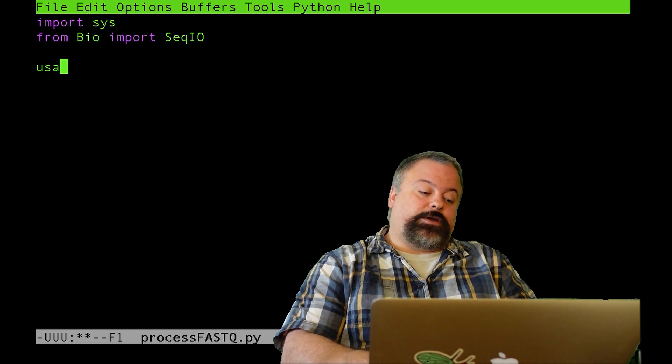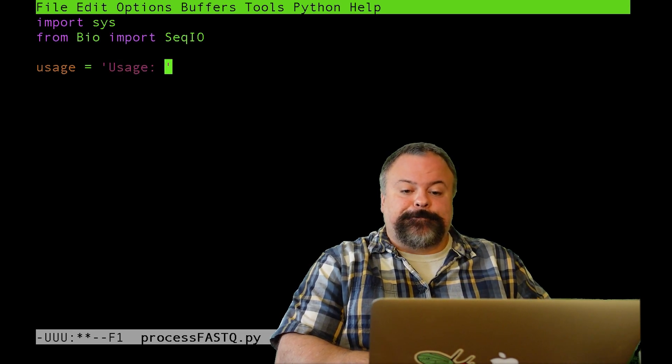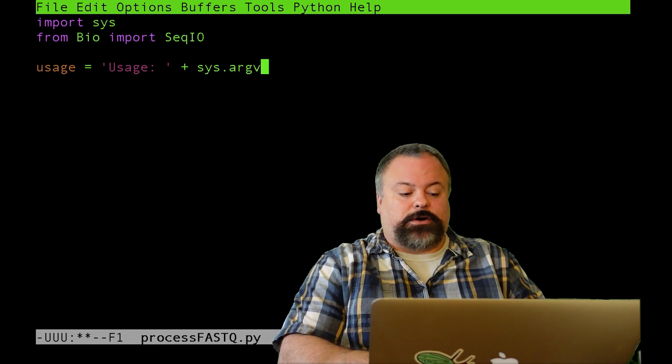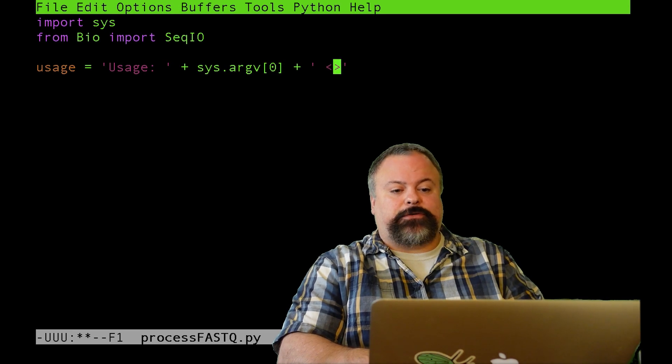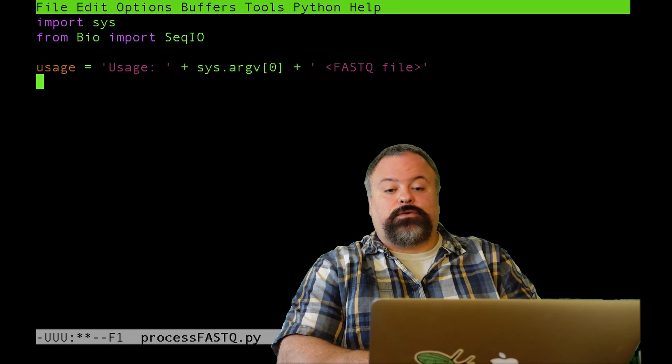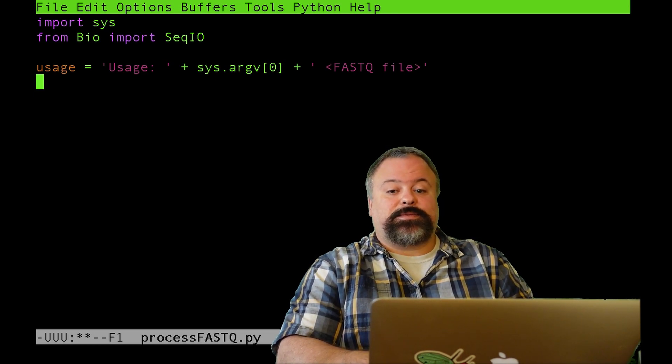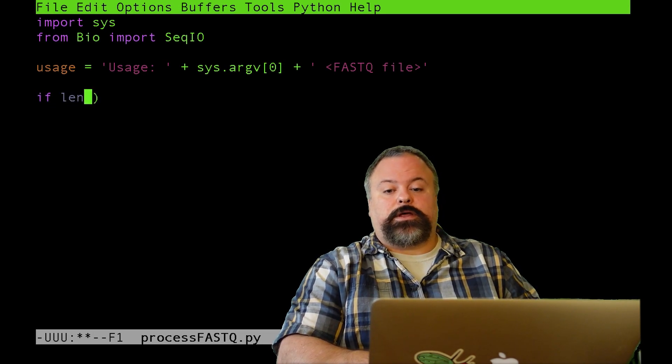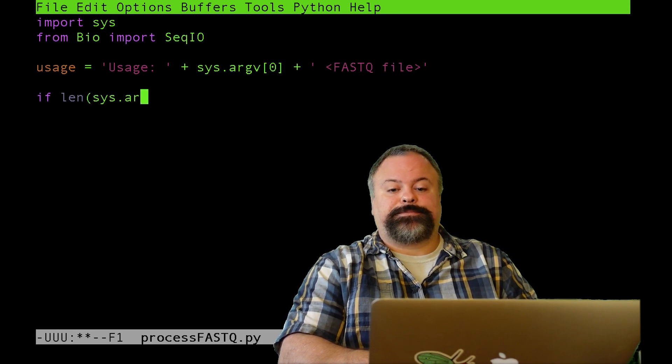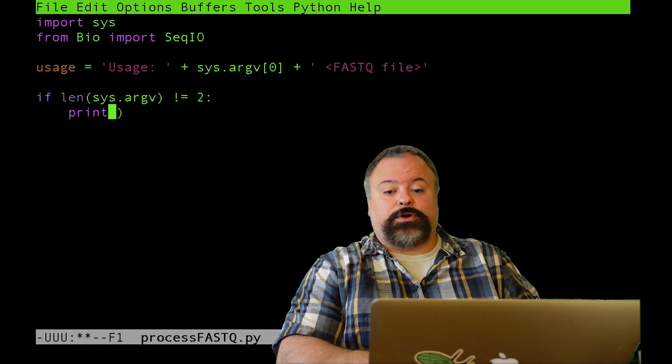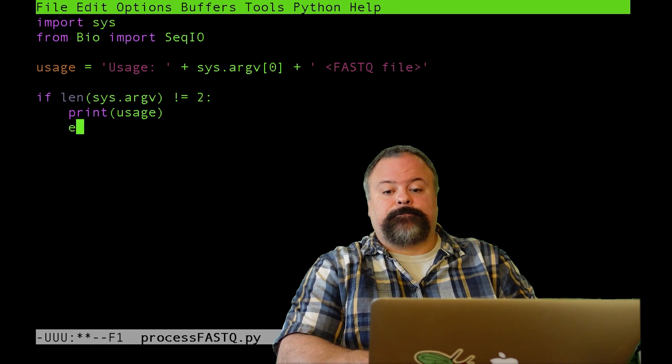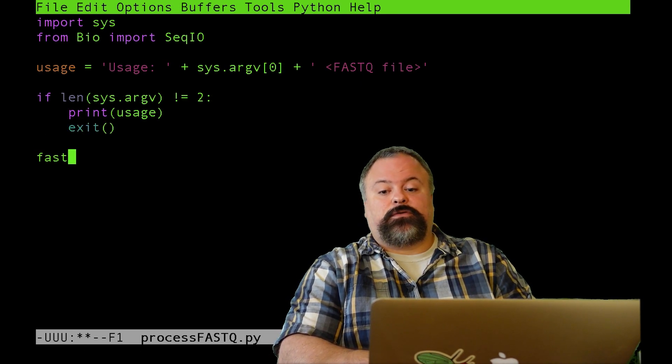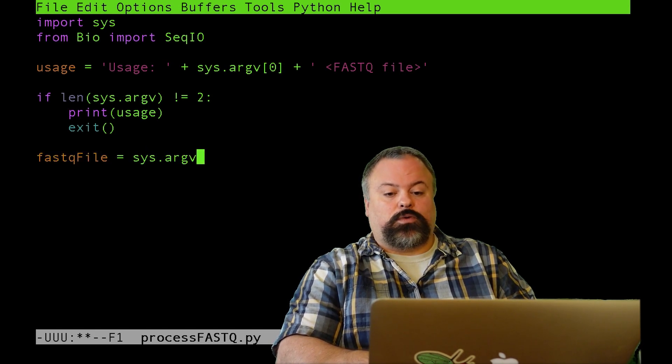So let's just start with the interface. I might define a usage statement, and what I would do is I would say usage, and then I would say the script name itself, which is stored in sys.argv[0]. That's the first argument on the command line, and then I might remind myself, hey, this is expecting a FastQ file as the second argument. And so if there are two arguments in sys.argv, which is a list that's extracted by the sys module, then I'm okay. If not, then I don't have enough arguments, so I need to do something like this. If the len of sys.argv is not equal to two, I want to print the usage statement and I want to exit.